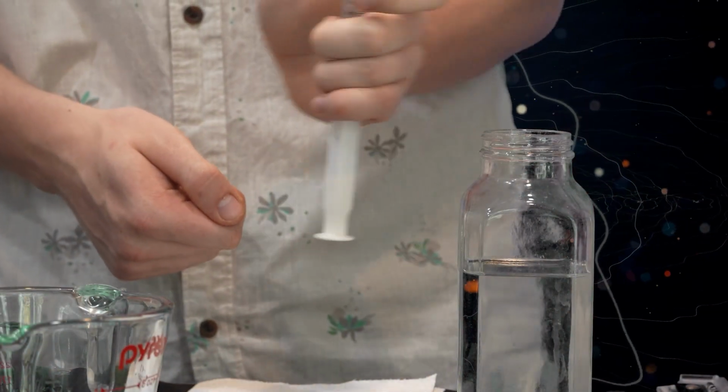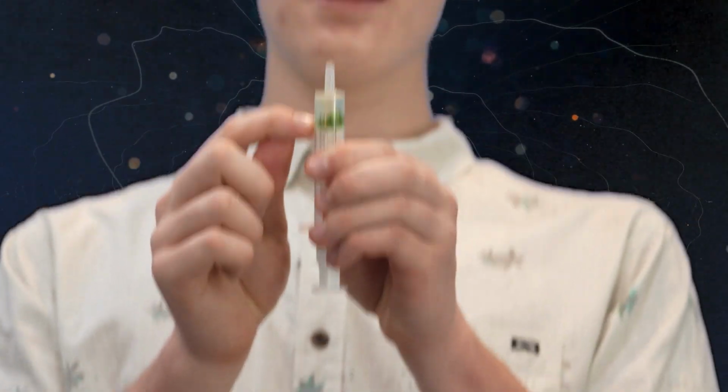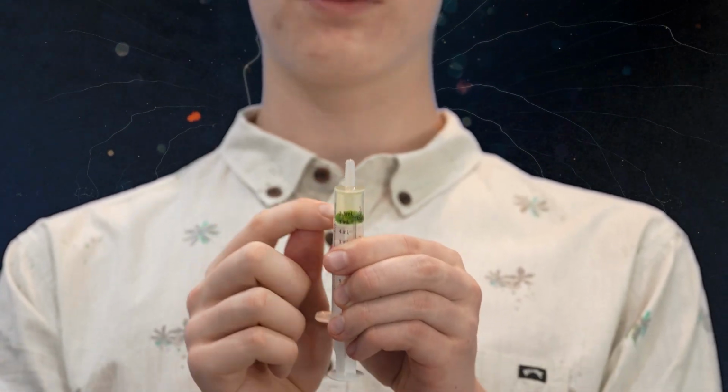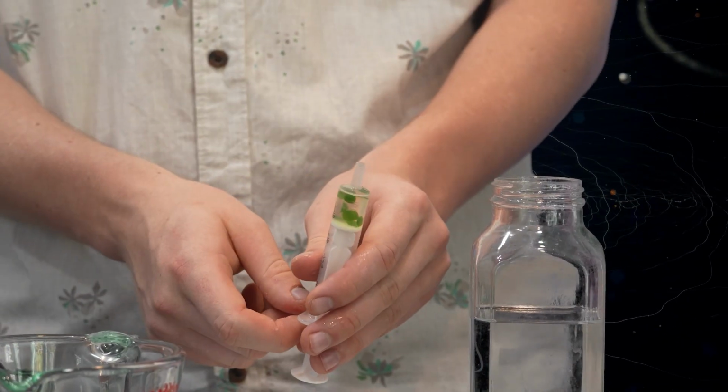And then what you're going to want to do from there is shake it violently for 10 seconds. And after you're done with that, you can let go of the top. Boing! Now, as you can see, none of the spinach little circles are floating on the top. They're all floating on the bottom here. And that's exactly what you want. Sometimes it doesn't work on the first try.